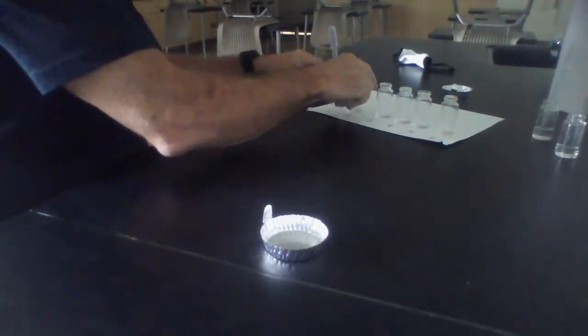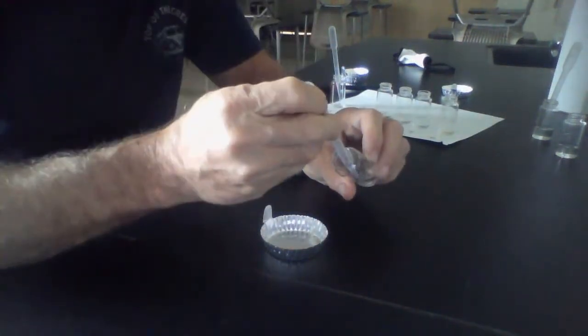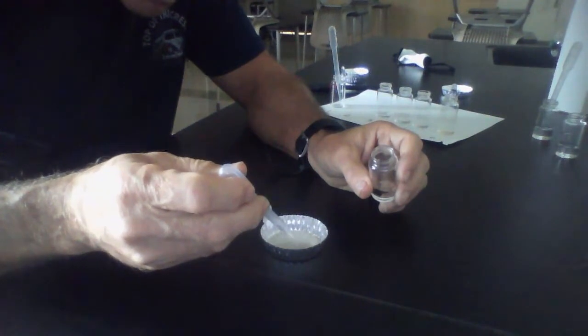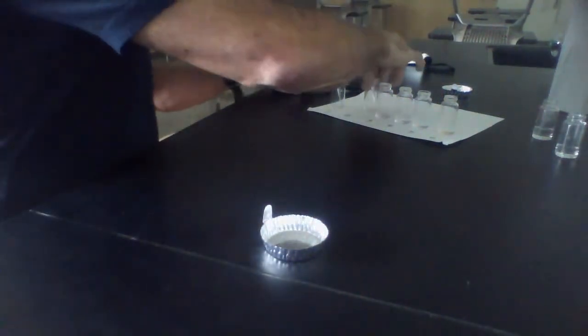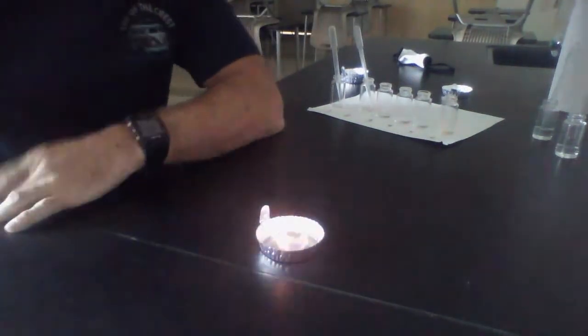Okay, I'm just going to keep rolling. Number 2, fresh weighing boat, fresh pipette, 5 drops. 5. 3, 2, 1, ignite.